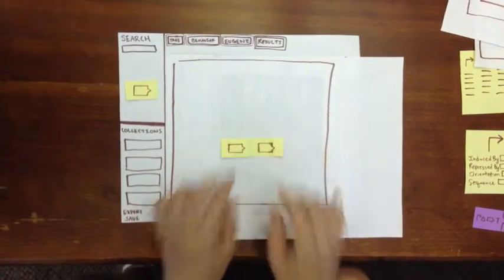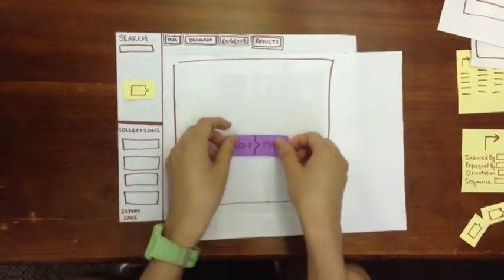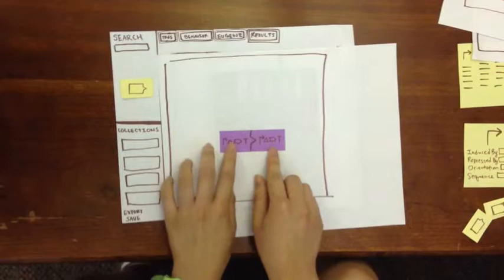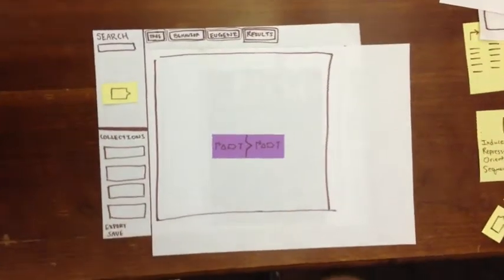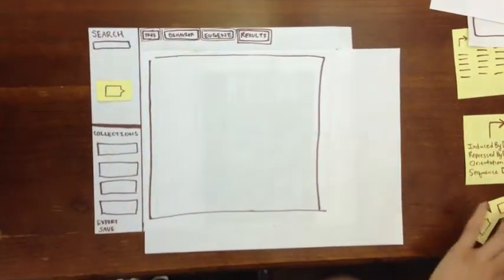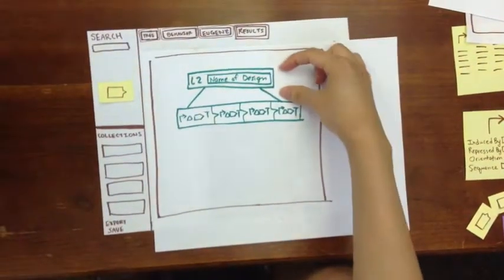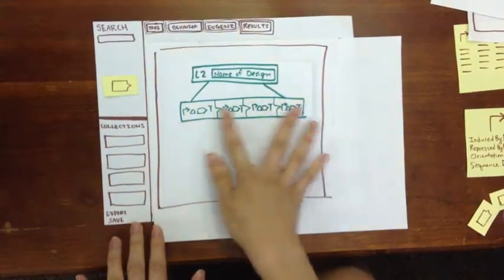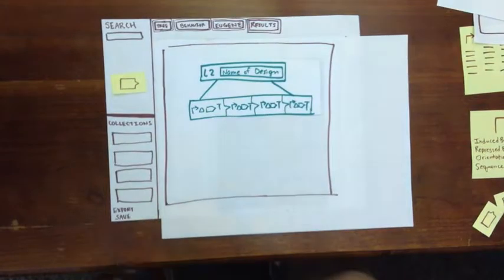So when two pieces are touching next to each other like this, they create an icon that looks like this, and the little point here indicates that these two are connected and that they are in this order. So after we build upon this, we can create a complex system of devices. Looks like this. And so here at level 2, you can input the name of the design, and here are the level 1 devices that comprise this level 2 system.